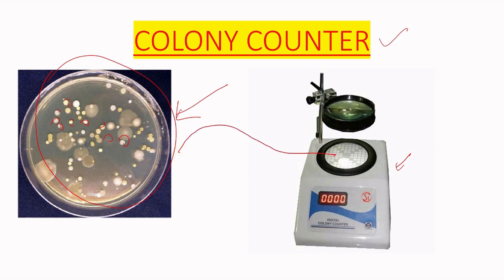First, we put the petri plate into this position. A quadrant is present here so we can count. A magnifying glass is present and one pen is given with this equipment or instrument. We will observe the petri plate from this direction through the magnifying glass.